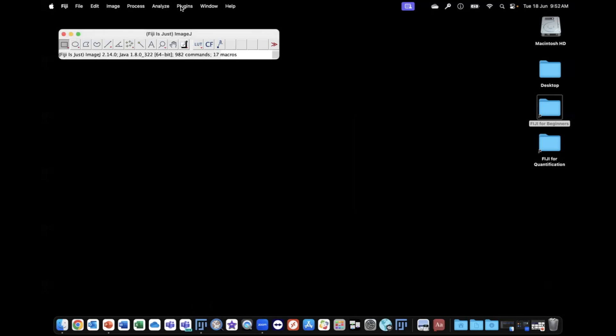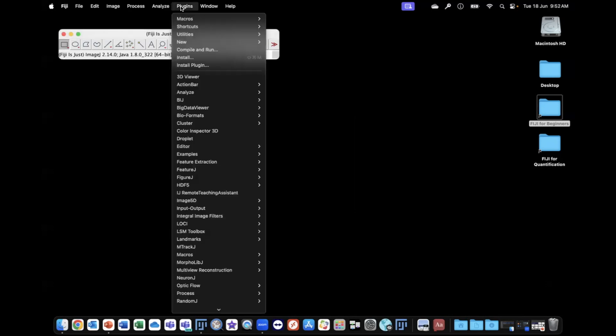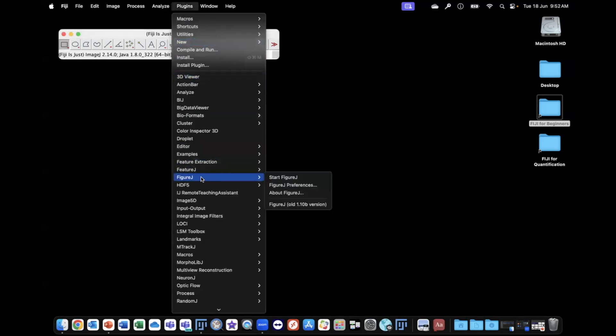Now, when we go to Plugins, we'll see that Figure J is sitting there.